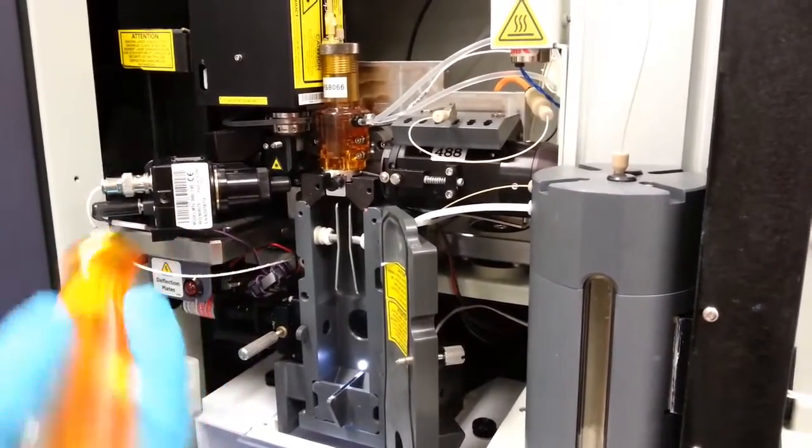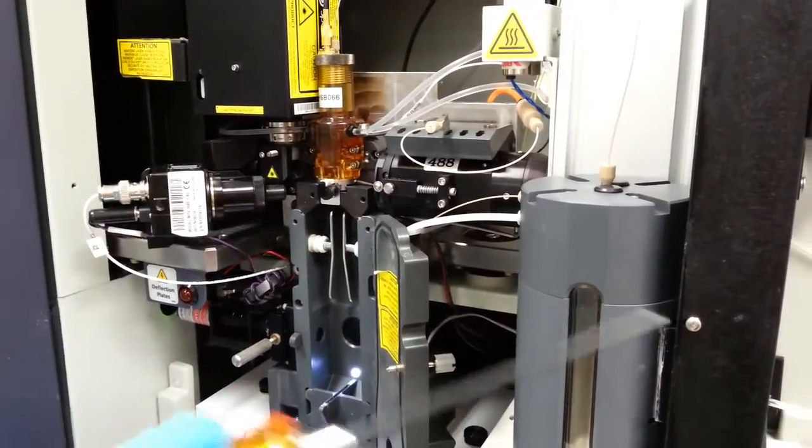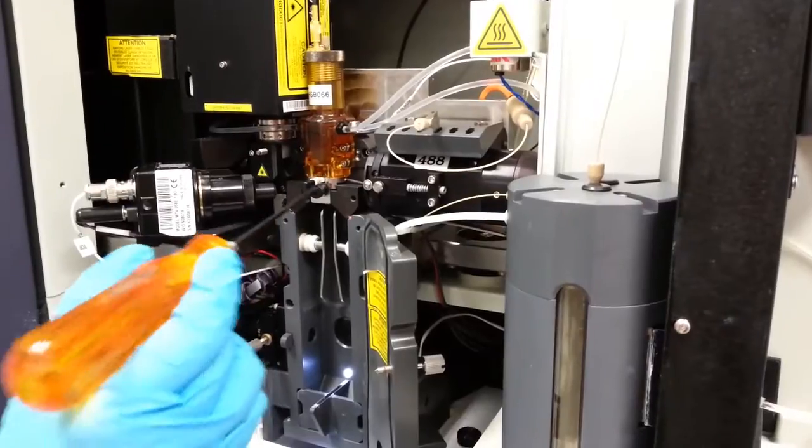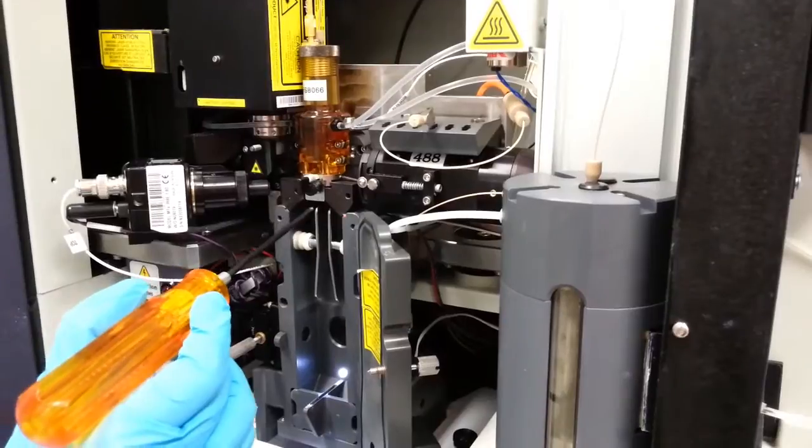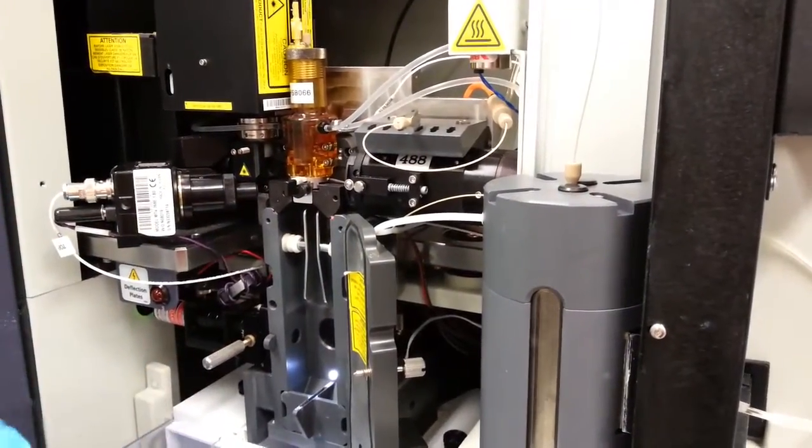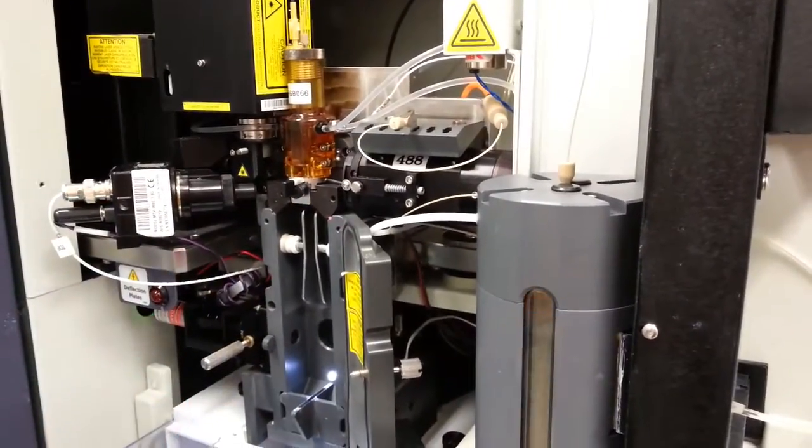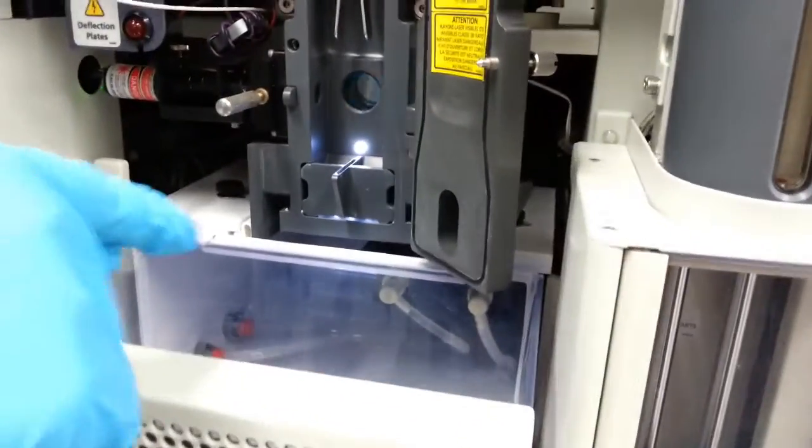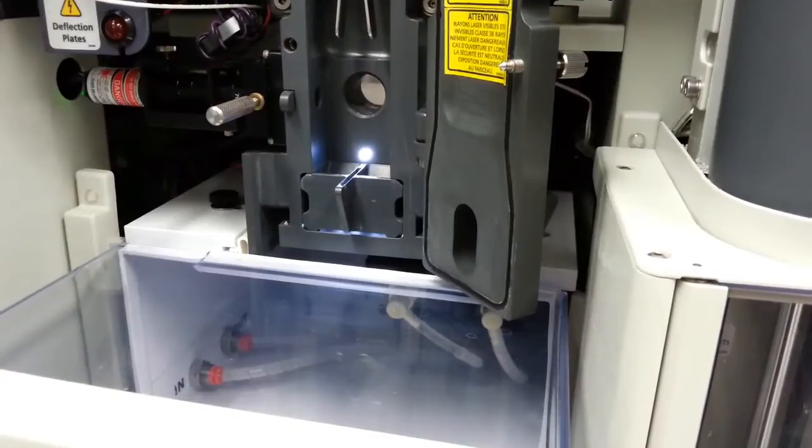In the meantime, if a cell that you have identified as one you want, that is in a particular droplet, well that droplet will receive an electrical charge, either a positive or a negative. And then, as it passes through these plates here, which have got a charge on them when I switch it on, those cells are deflected either left or right, and into a bunch of tubes that I haven't inserted yet, but they will drop into there as pure populations.